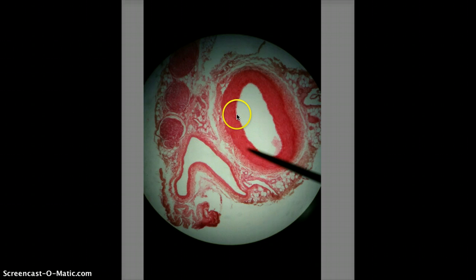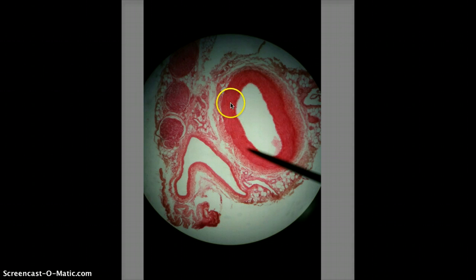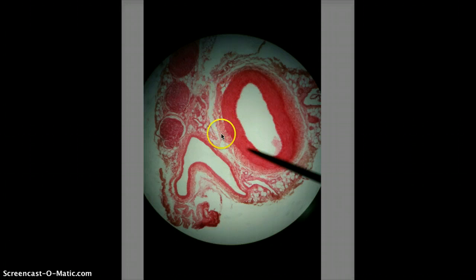If the pointer is on the innermost layer — just this single little line right here — that layer is going to be the tunica intima. Then if the pointer is in the middle of the thick red region, it's going to be the tunica media. And if it's out in the patchy region, that's going to be the tunica externa.